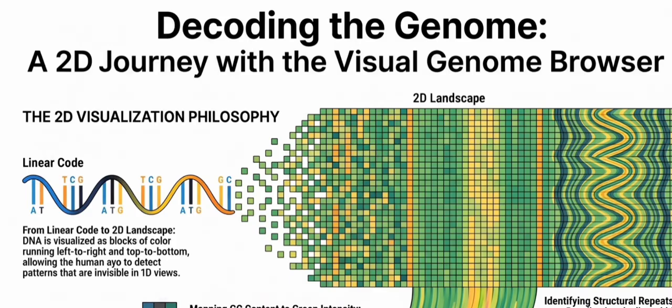So how does a researcher actually visualize this in the Visual Genome browser? Because opening two separate browser windows and trying to stare at them side by side to spot a one-letter difference among thousands sounds like a total nightmare. It would be impossible. The software solves this through data integration. Instead of opening a new window, you load the compressed VCF file as a direct visual overlay on top of your currently navigated view. The standard reference genome remains the structural foundation, the map underneath, but the patient's variant data is draped over it like a transparent sheet.